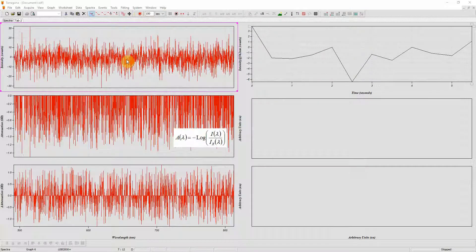I can now turn my light source back on and do my intensity calibration. For my intensity calibration I need to collect about 30 spectra.